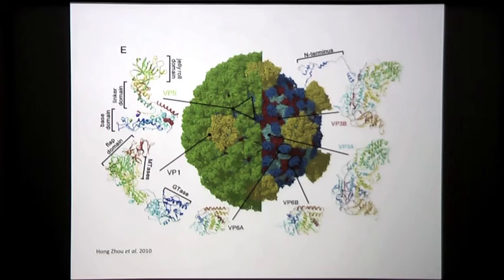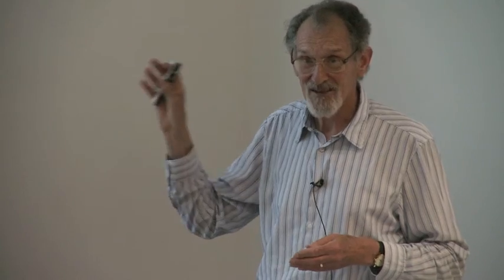and they could actually detect the cleavage of a critical bond, which was known to be important in the priming of this for infection of the host. So again, if you get to atomic resolution, you begin to be able to say something interesting about the biology of the system. That was 2010. Several big virus structures came out. They're like rocks, they're easy to orient, and they're high contrast. So all the way through, it's been viruses at the forefront of technical developments.